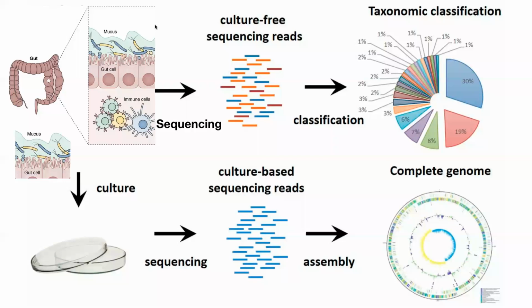So there's a lot of things that you are actually sampling. There are two ways that you can do it. You can extract the mucus and culture an individual strain of bacteria and grow it in a petri dish in a lab, and then sequence and understand what's going on. Or you can take the full sample and then sequence that material culture-free, selecting for something very specific. We'll talk about how we do that.